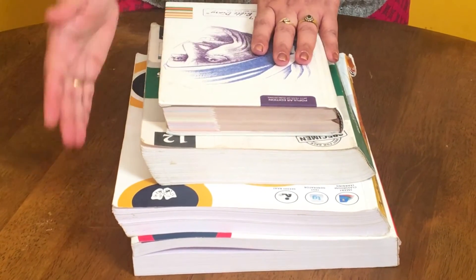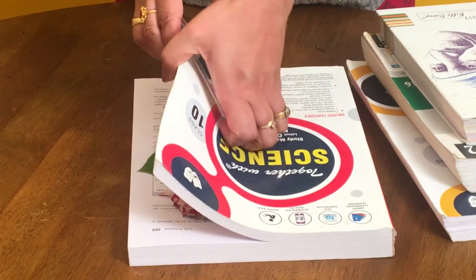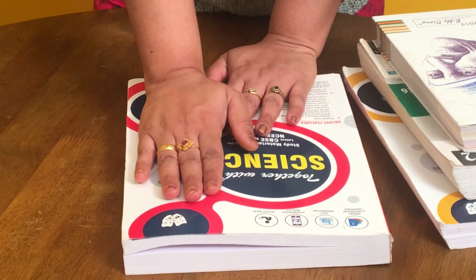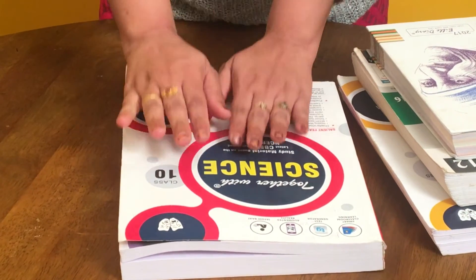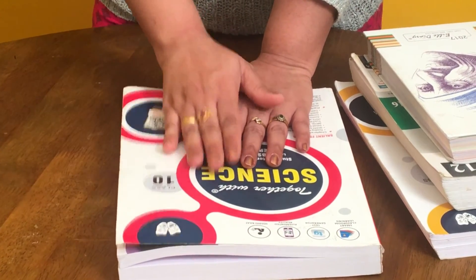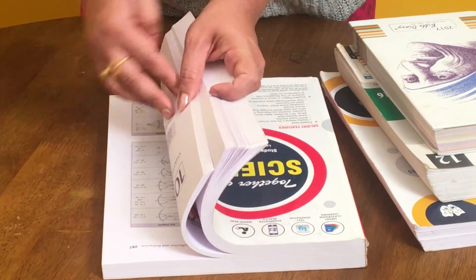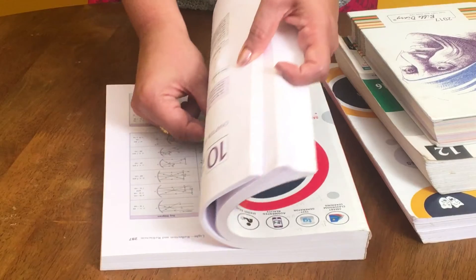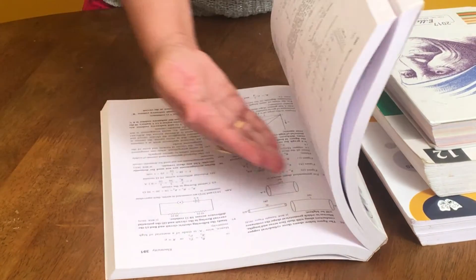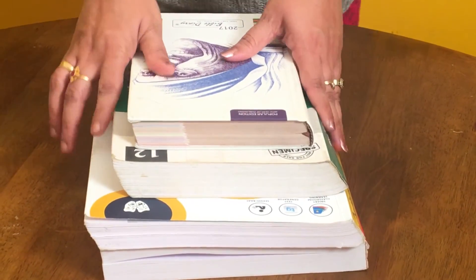Every day you need to open the page and remove the branch from that page and move it to another page. We do this because the moisture from the plant gets absorbed by the pages of the book. If you keep it for two or three days, there are chances that fungal attack can happen and it will destroy the plant parts. So every day, remove the plant material and keep it into a fresh page. This avoids fungal infection and will not lead to damage of the plant parts.